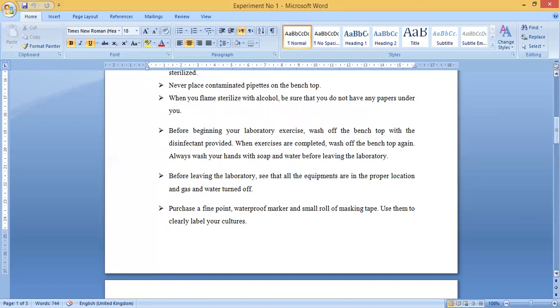Before beginning laboratory work, wash off the bench top with a disinfectant. Your bench top must be disinfected. When exercises are completed, wash off the bench top again at the end of the experiment. Always wash your hands with soap and water before leaving the laboratory. Your hands must be washed before and after the experiment, and your workstation must be disinfected and cleaned before and after.